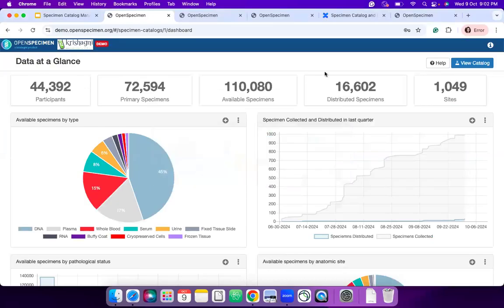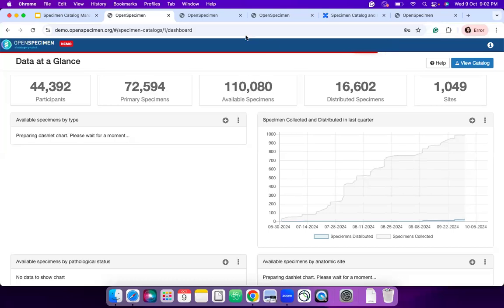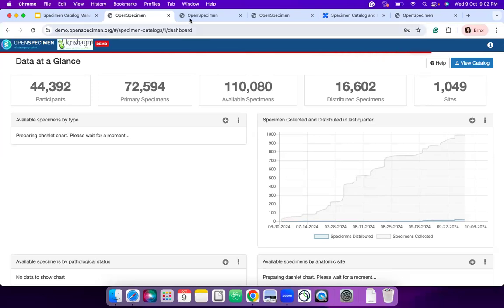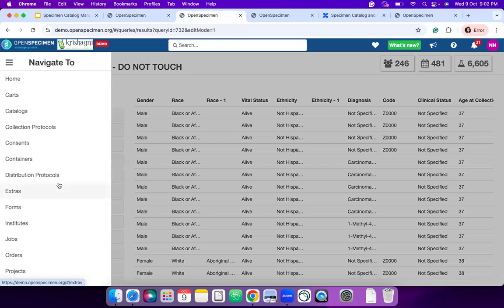Okay, let me go back and see if I am able to log in now. Rohan, Ashish, is this changed? I want to log into the application. I'm not able to. No, unfortunately, even we are unable to log in. It seems some issue on that. Hold on, that's going to be difficult now. Can you get help from Nilesh?